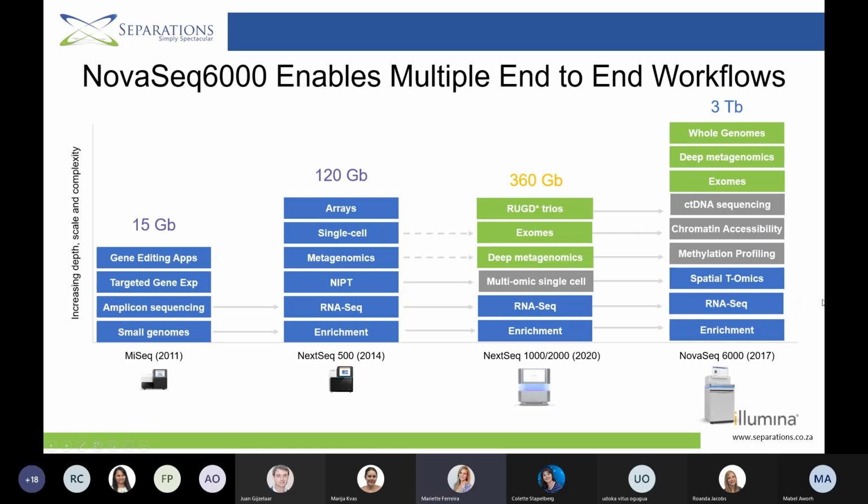And today I would like to focus on these 3 applications. So we're going to look at human whole genome sequencing, then RNA sequencing, so more transcriptomics, and then circulating tumor DNA sequencing for cancer applications.